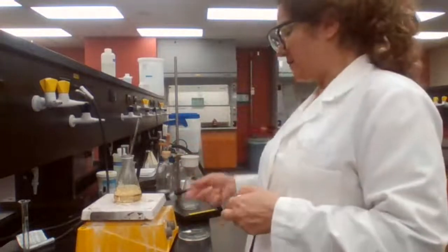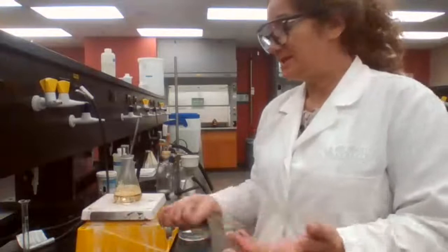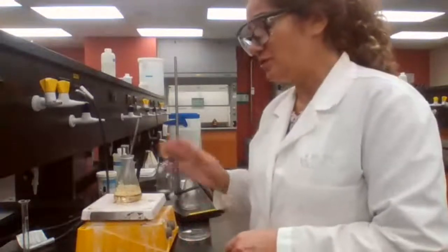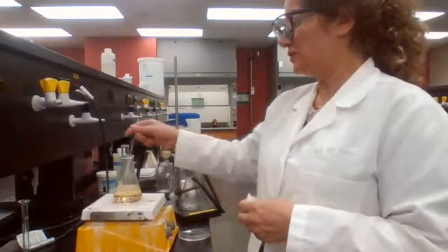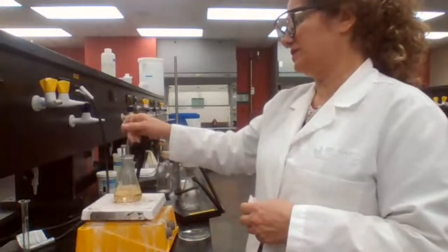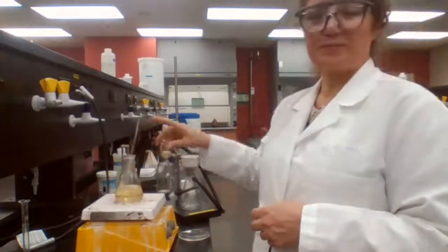I came back and put it back between 7 and 8. 6 and 7, but we don't want it too high. We don't want it at 9 and 10. We don't want it at 1 and 2, because we want it to boil, but at the same time we don't want it to foam out.